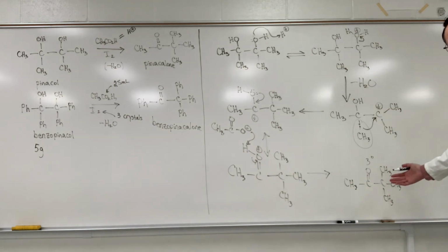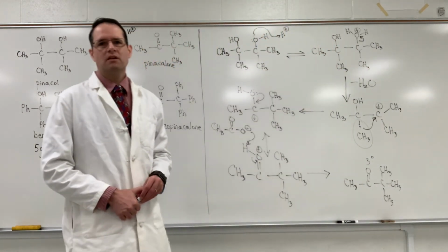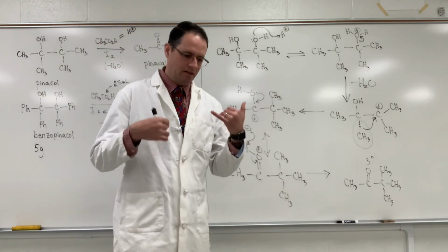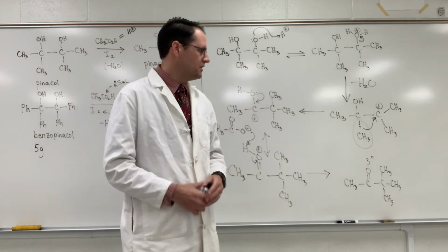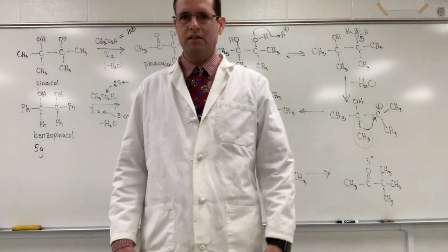I always wondered why they called this pinacolone. There is actually a bottle of pinacolone back in our chemical supply cabinet, and I smelled it, and it has just a very rich pine kind of cologne odor to it. So this is a very nice smelling compound, interestingly enough.